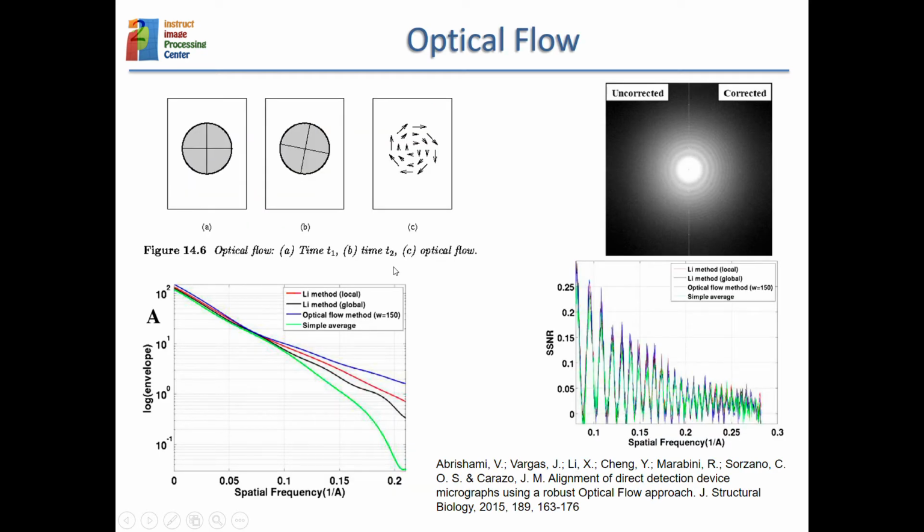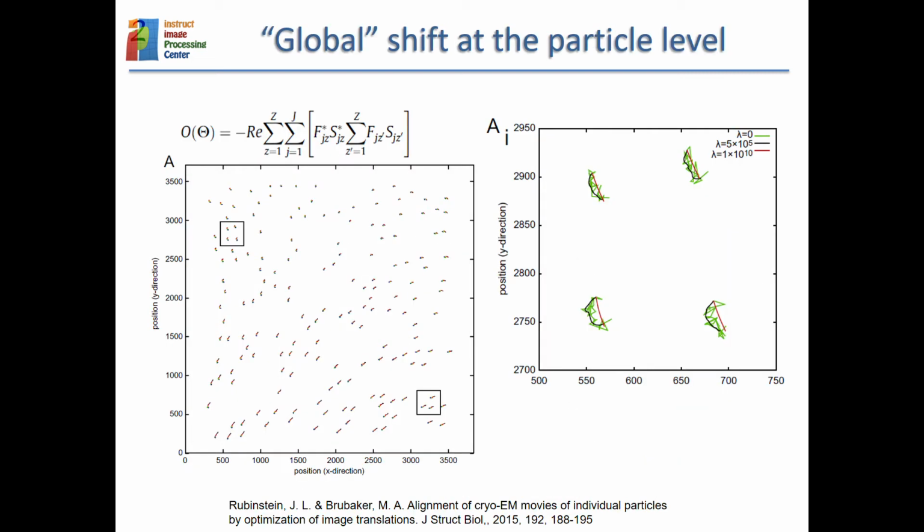And for instance, optical flow is another one that is really free. It allows every point to have its own trajectory, so a little bit it is represented here. So you have 2 frames, and then every point has a different path. And this is very rich, but it also took a lot of time to compute. And then now in Xmipp you have still the optical flow available, but we are also promoting the use of some other algorithm that is based on B-splines.